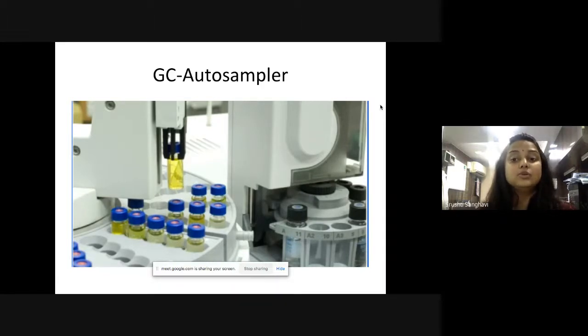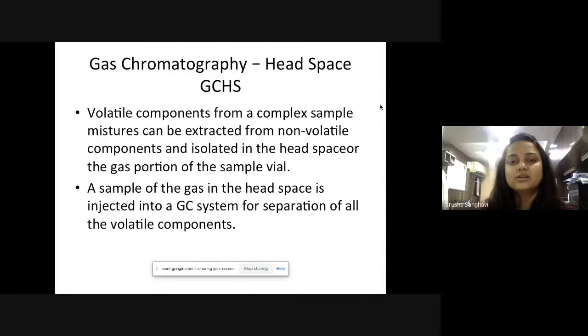So as an example, you can set the analysis on Monday morning, come back on Wednesday evening, and you would have probably completed like 30-35 samples. Or if you're gone for the weekend, you just put in all the details on Friday afternoon, and you come back Monday and all your data is ready. Great, fantastic. Okay, so that is how it works. Now, any questions related to GC?